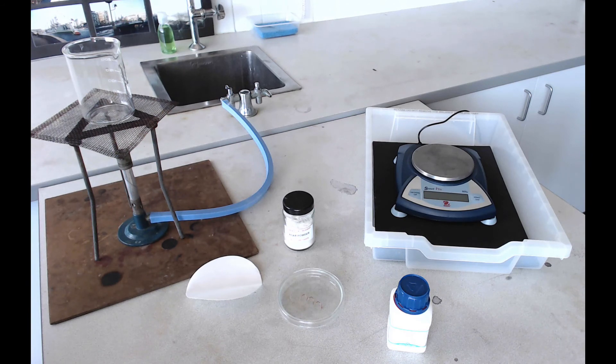We'll need to take a photograph of these — we'll most probably use the dinoscopes to do this so that you can get a good close look at those crystals, and you're going to look for any kind of regular patterns that might appear. That's how the practical works. If you've got any questions, make sure you ask your teacher, and make sure you write yourself a nice clear method before you get started.